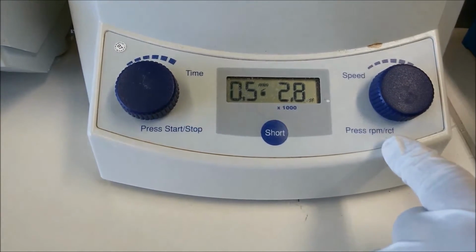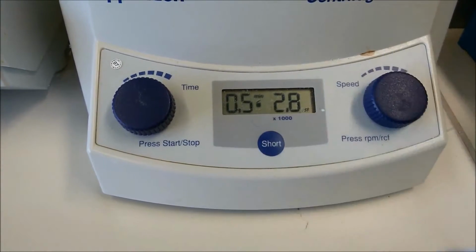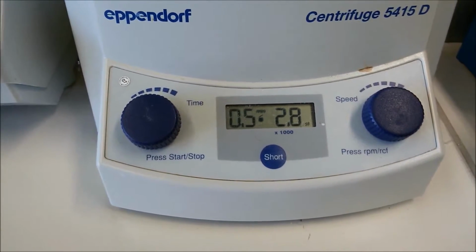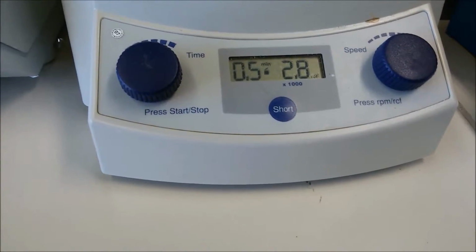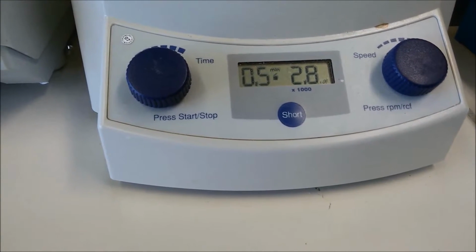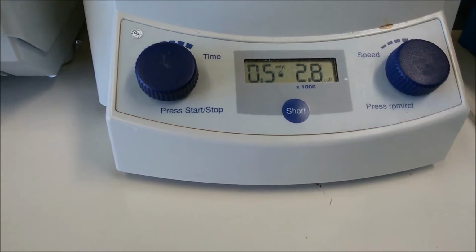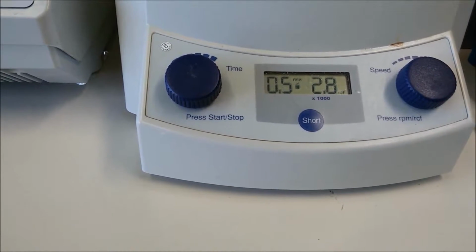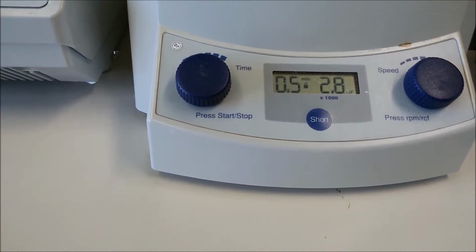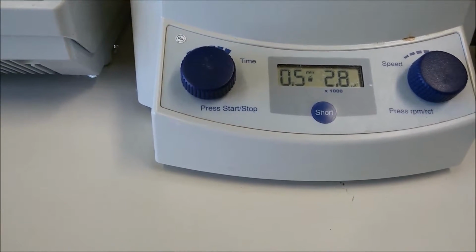There is RCF, don't worry about this. We will tell you about the centrifuge tutorial, how to deal with them. So this is just a very normal tutorial just to make you familiar with what centrifuges are and how they work. One more point about this centrifuge is that you can only use it at room temperature. So you can only use these centrifuges if you need only room temperature. But if you need a centrifuge at a different temperature, you have to use a centrifuge where this feature is there. So now I will show you a centrifuge which has the temperature feature.